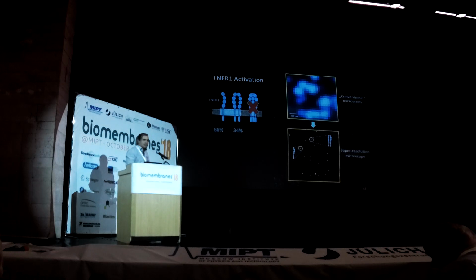So we looked a little bit into biochemistry, and TNFR1 is a very well-studied system. There's a domain on top of this receptor which is called the pre-ligand assembly domain, the PLAD domain. And it's apparently this PLAD domain which drives this weak dimerization. So if there's a domain which drives something, we can mutate it out. We did two different mutations. I can't see them, but hopefully you can see them. And when we did so, we don't see any dimers anymore. This is good news.